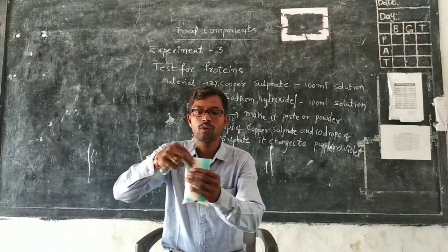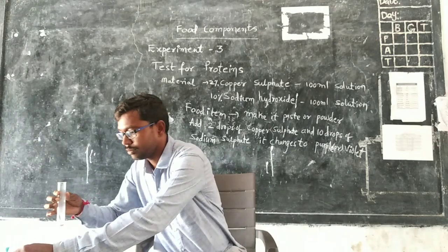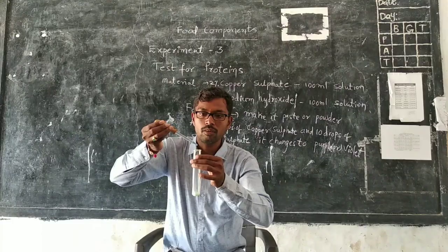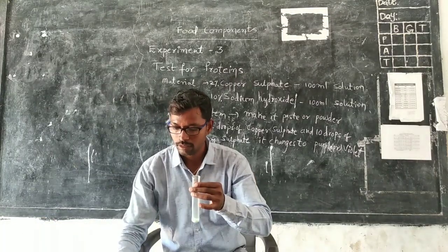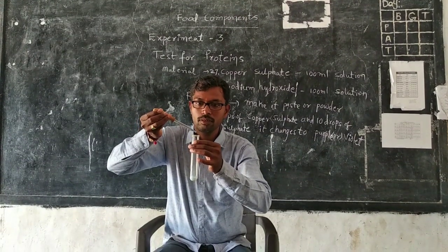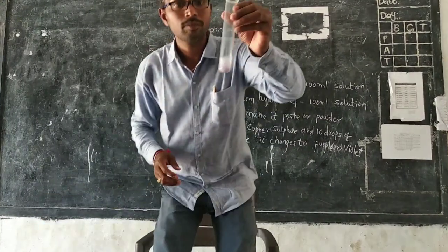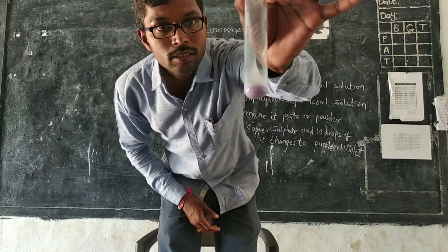Now I will test one more food item — milk. Take milk into the test tube, then add two drops of copper sulfate and ten drops of sodium hydroxide. When sodium hydroxide is added to the milk, it changes to violet color. This proves that milk also consists of proteins.